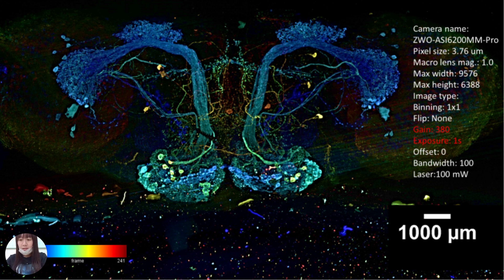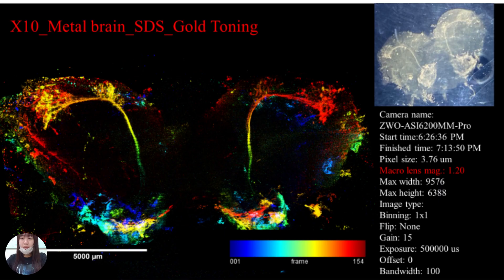Consequently, the research team is currently in the process of developing metallic-stained samples with the aim of mitigating the aforementioned challenges. This is our latest test method. While it addresses the issue of photobleaching, it results in sample overexposure and an inability to filter impurities in some areas. Therefore, it is still under refinement.